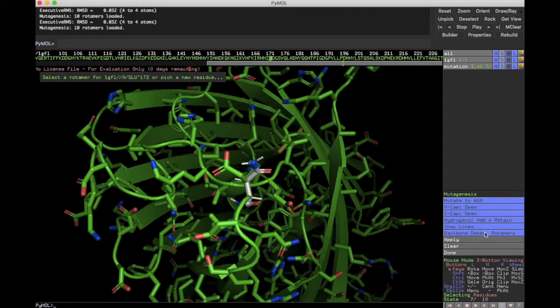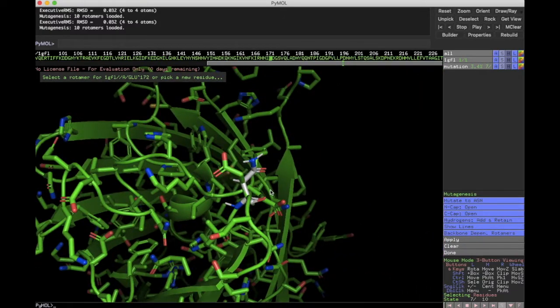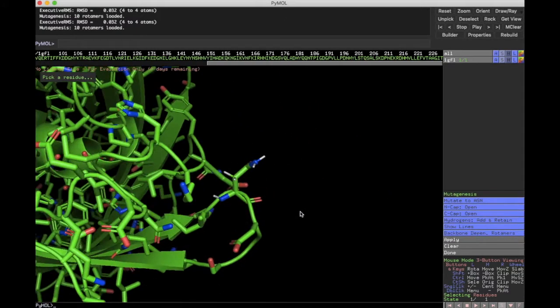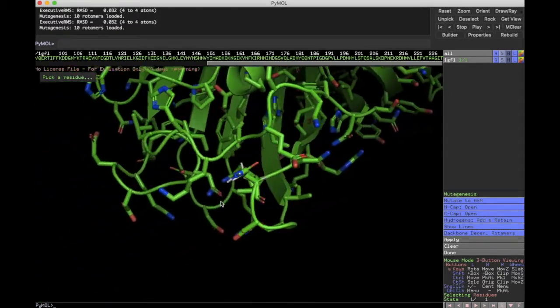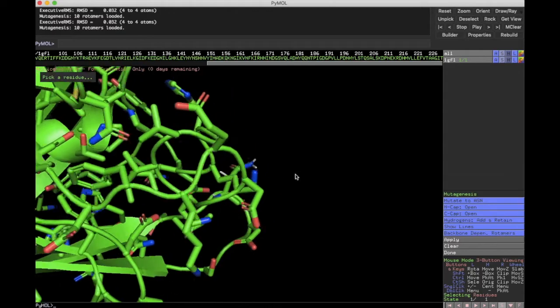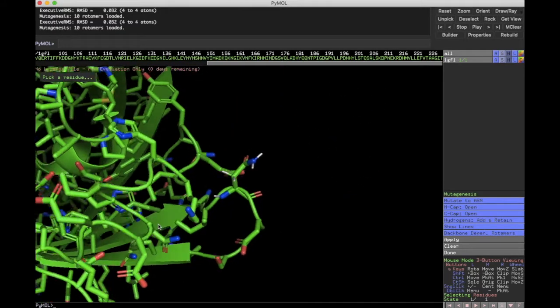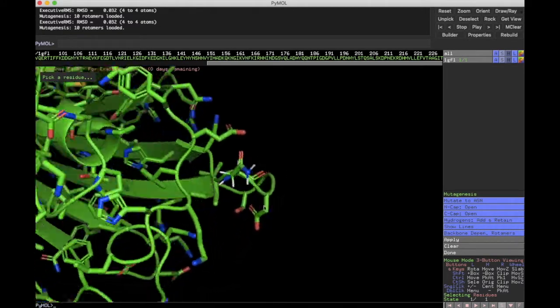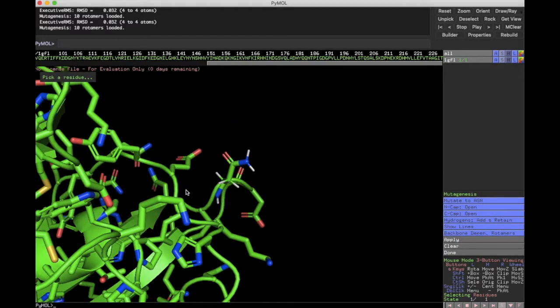Okay. All right, so if that's good for us, if we want to change this to an asparagine amino acid, we can click apply, and then all of a sudden we now have a mutated asparagine in this protein. Right? And so that's the first step to mutagenesis. In general, you then need to do what's called sculpting. You need to see how that impacts the overall structure.